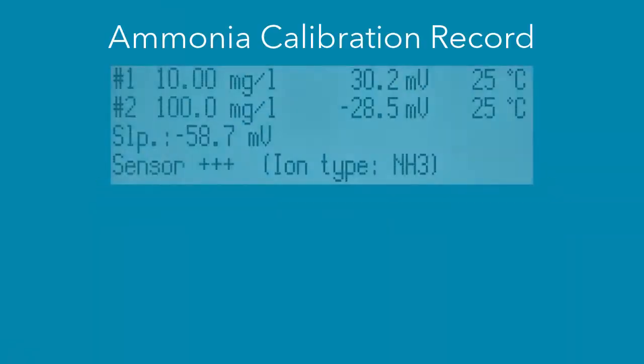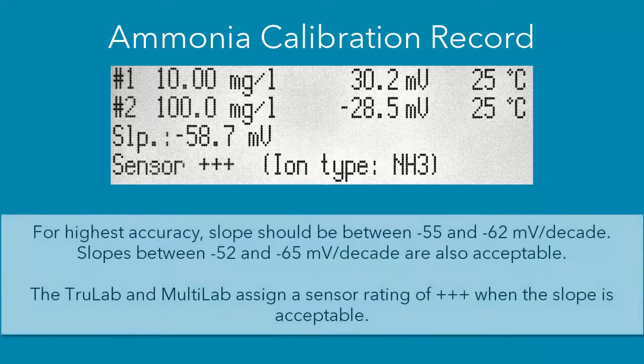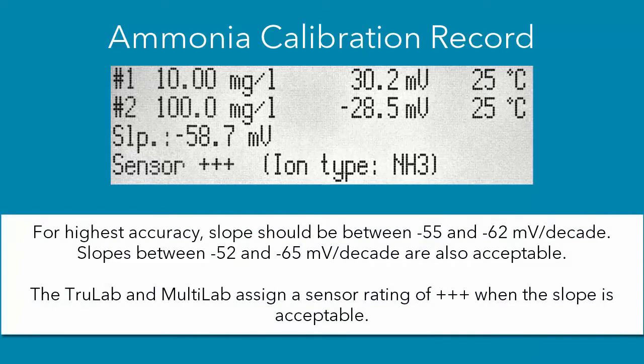So when calibration is complete, a full calibration record will be shown. This calibration record will display the calibration points that you did. So in our case, we did 10 and 100 mg per liter standards. And you can see the millivolt values that are associated with that. Also, the slope will be displayed. You will really want to pay attention to what that slope is because that will tell you how good that calibration was basically.